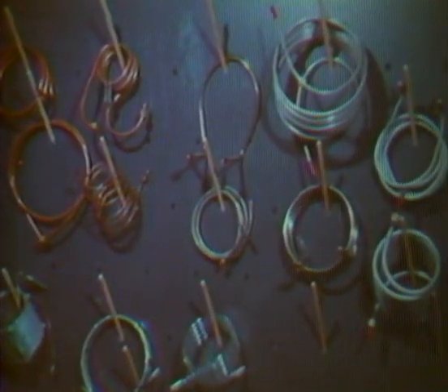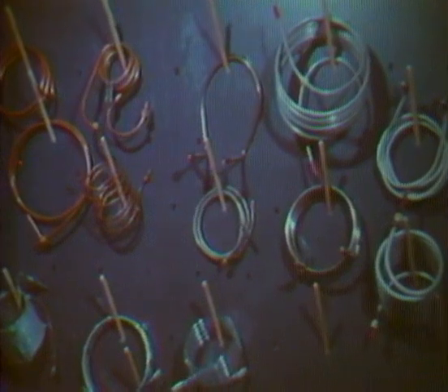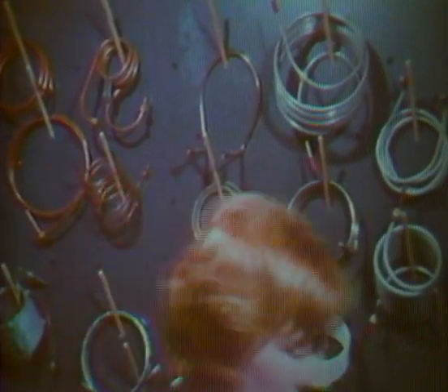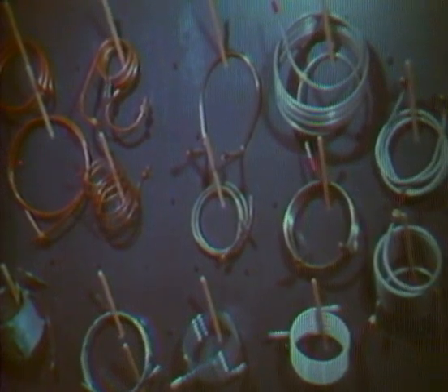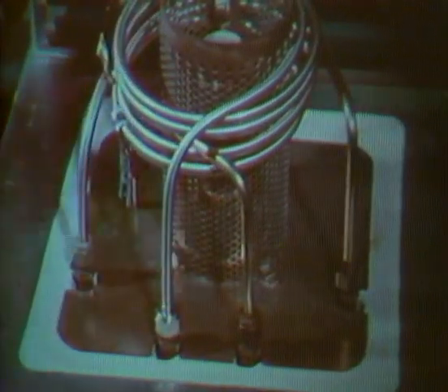The column is the heart of a gas chromatograph, and choosing the proper one is very important. There are two basic types, packed and open tubular. The shape of the column is determined by the geometry of the column oven. Coiled columns permit the use of small ovens. If a U-shaped column is preferred, the instrument requires a larger oven.